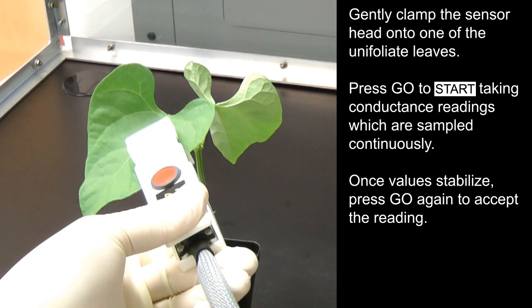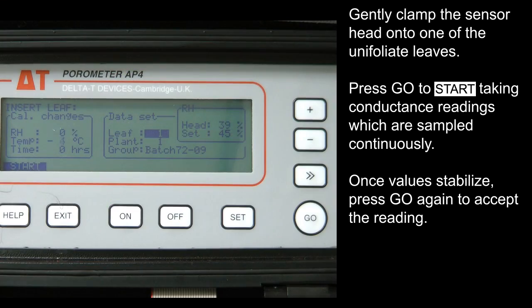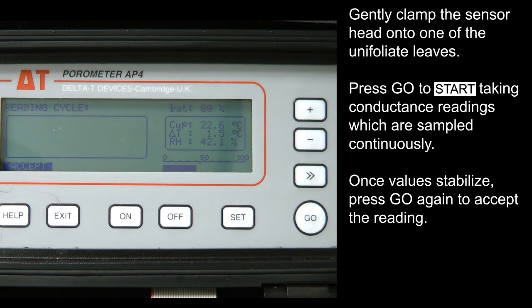Gently clamp the sensor head onto one of the unifoliate leaves. Press Go to start taking conductance readings which are sampled continuously.